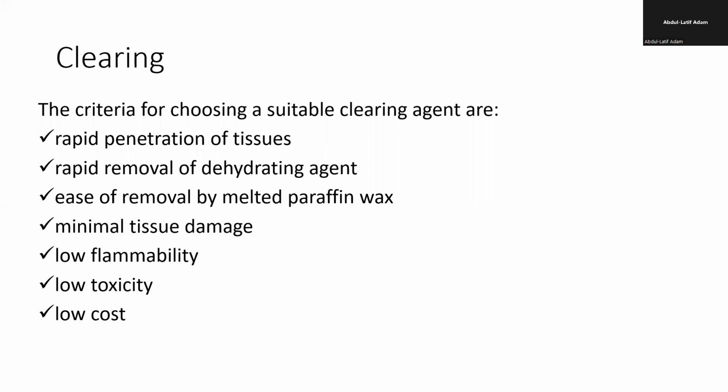But unfortunately, the xylene that you are using is very flammable. It has to be kept away from fire. Whenever there is xylene, you must not bring fire near it, because of the properties of xylene. It's very good as a clearing agent compared to the others, so you want to stay away from fire as much as possible so that you don't cause fire outbreaks in the lab, okay? And then it should cost less. Compared to the others, xylene is cheaper.